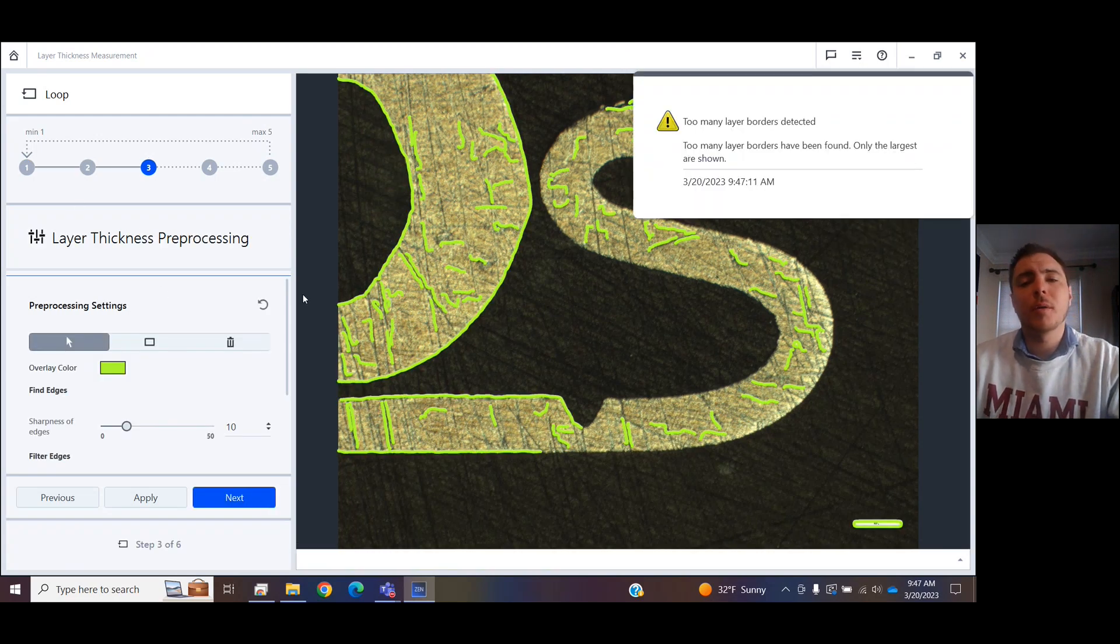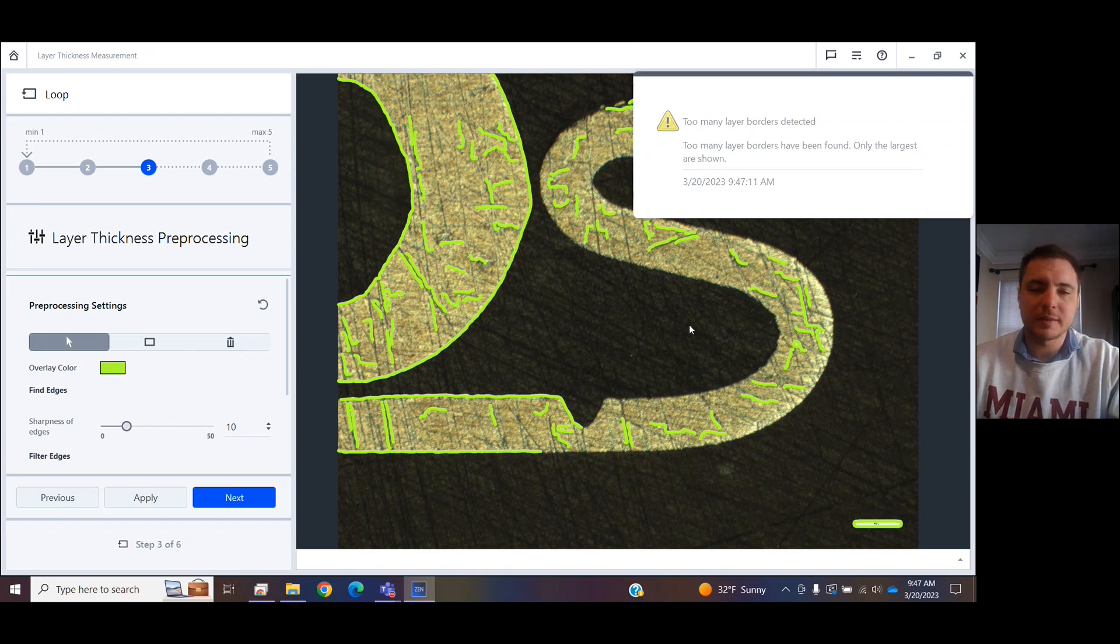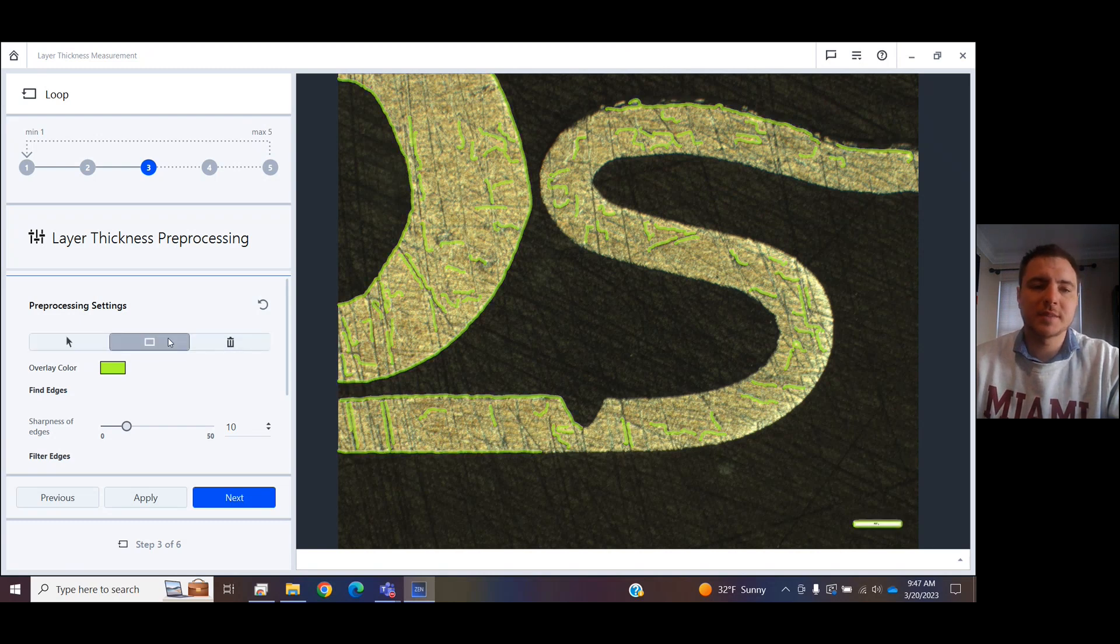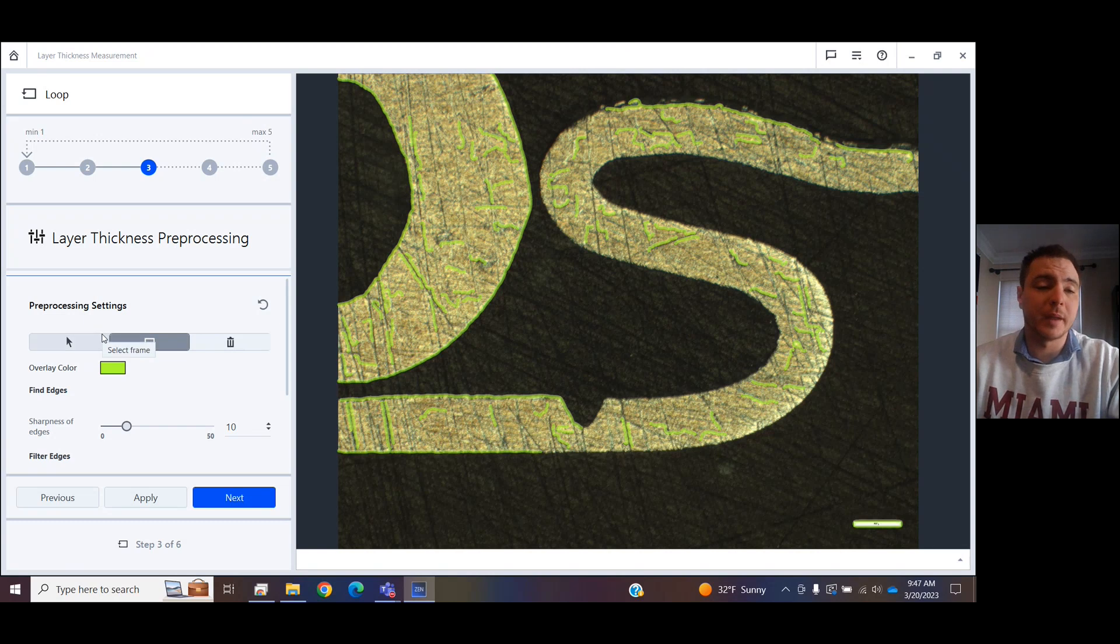And now, we are going to begin the Layer Pre-Processing step. We see that it automatically detects way too much. We need to clean this up. Let's say that I want to measure where I want to measure my layers in here.